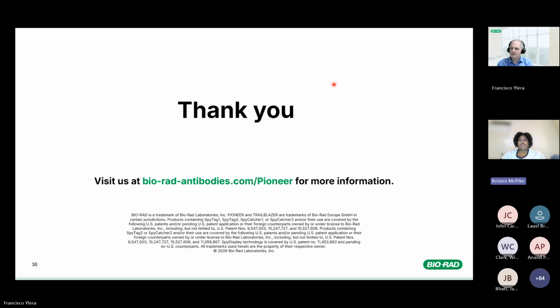That absolutely makes sense. And a follow-up question from Adrian Sachs. Have you had any experience with canine phage display library? Anything specific to be aware of different from humans? No, we don't have any canine libraries. Those exist. There are companies that have generated such libraries and generate antibodies to treat dogs. But again, I don't have the details, the insight on those. We focus on human antibodies.